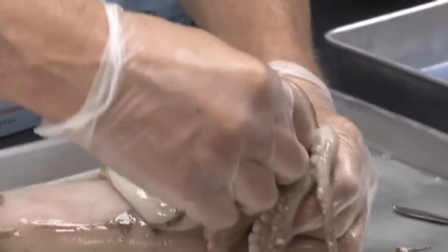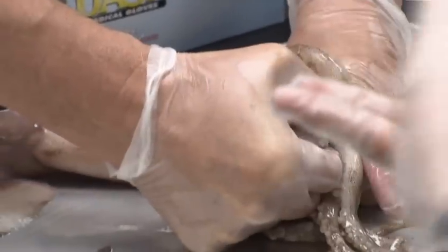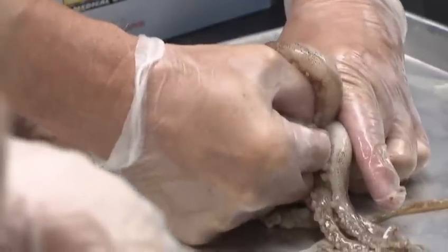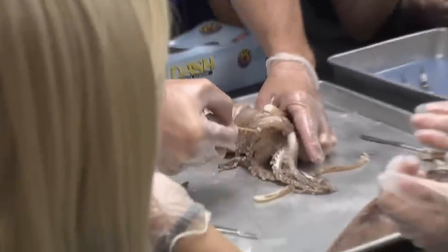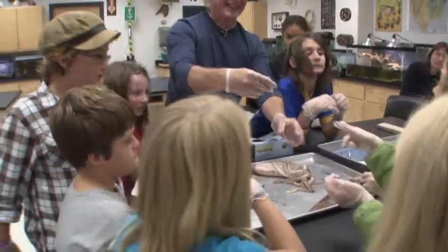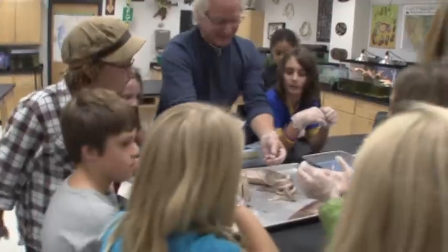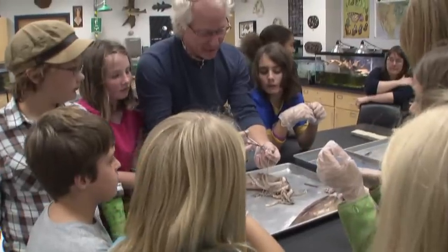Okay, now I'm going to pull this out, and I've got to be really careful because I want to keep part of the esophagus here. Has everybody seen the lens? Yeah. Okay. What is that? It's the beak and the esophagus. Where's the beak? Oh, I'm going to show you the beak. I'm going to show you where the radula is.